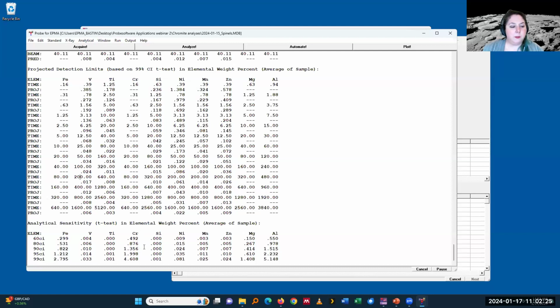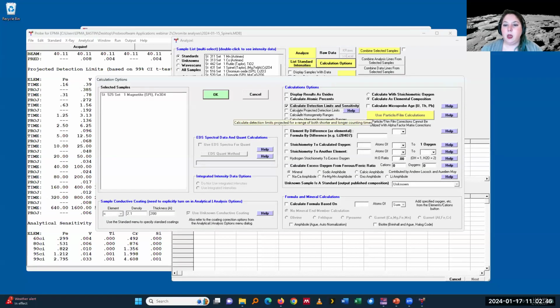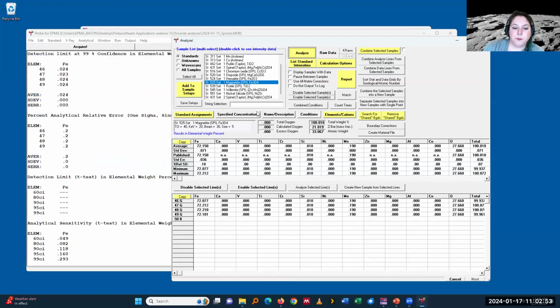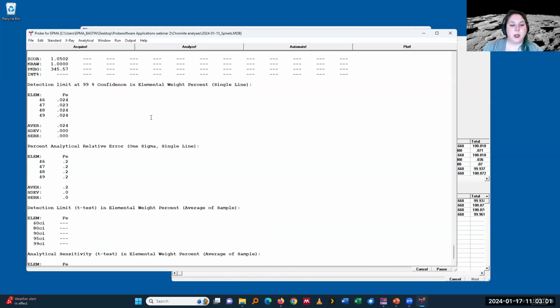And the same for the sensitivity. So this is a nice quick way to see how my precision is doing with the data. And so it calculates all that. The same thing can be done for the standards. Again, exactly the same options are available there. And we can look at that. Now, again, here in the background, there it's usually just 1 or 2 elements that we analyze.